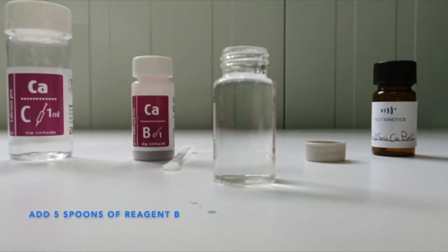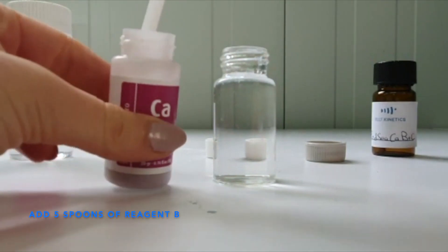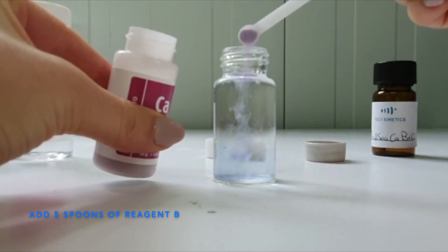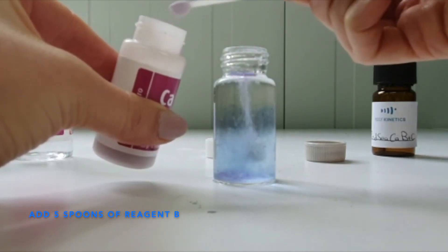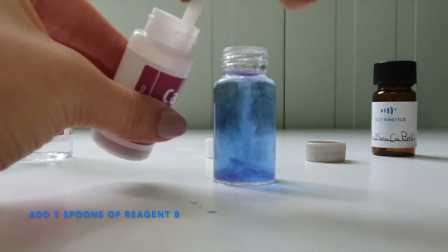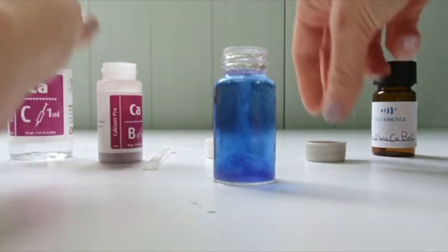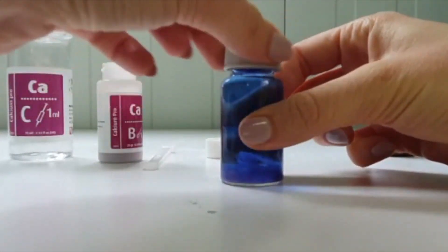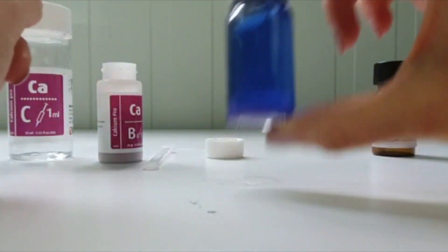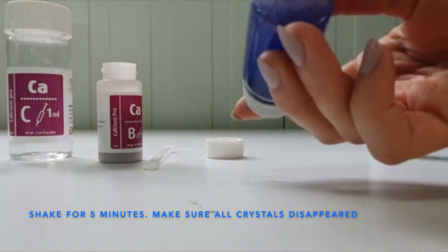Now add 5 spoons of the powdery agent B. Close the vial by its cap and shake the solution very well until you obtain a clear solution.